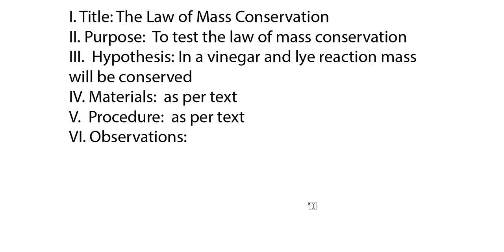Here we're going to record all the data and observations we get. We're not going to analyze that data, just record. So let's move over to our experiment.